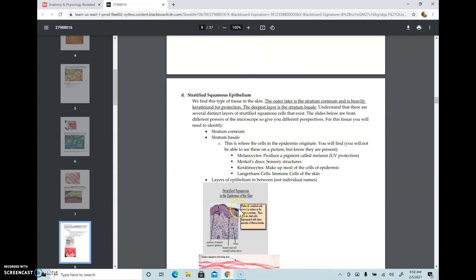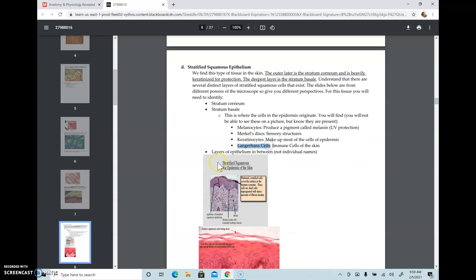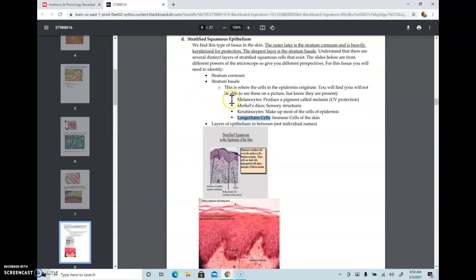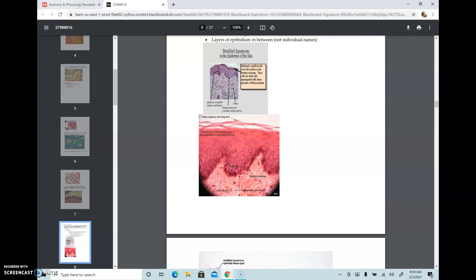Stratified squamous epithelium is present on the epidermis of the skin, and the top layer is called the stratum corneum. Other cell types present in stratified squamous keratinized epithelium include melanocytes that produce melanin, Merkel discs that are sensory structures, and Langerhans cells that are cells of the immune system. All of these cells are present in the stratum basale, the basal layer that is constantly dividing. As we scuff off the top layer — which is a layer of dead cells — the underlying layer becomes the new layer of dead cells to provide protection.